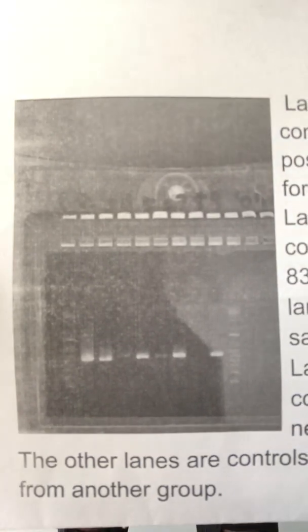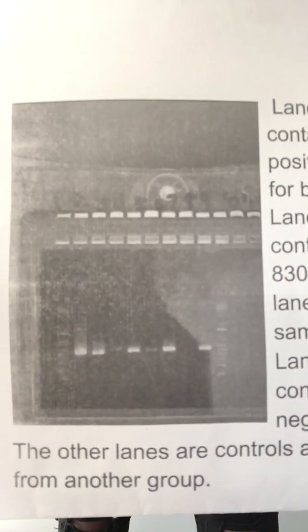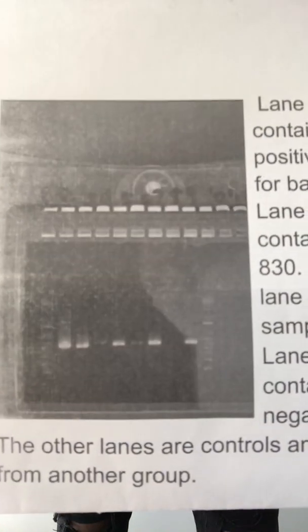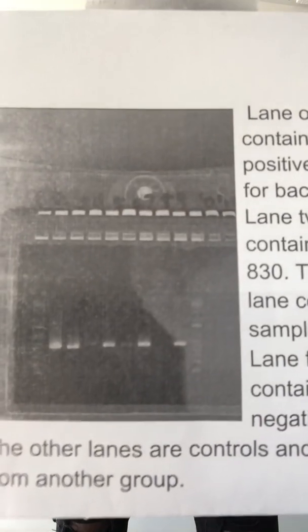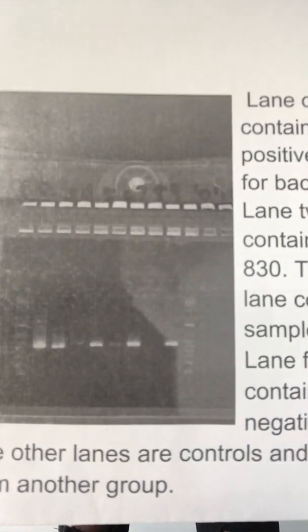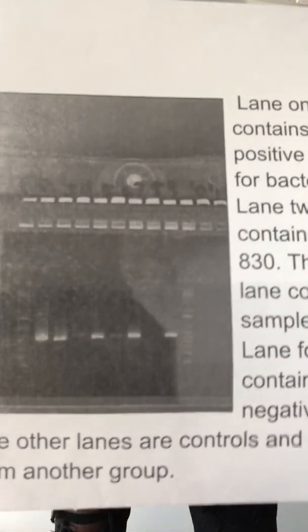Unfortunately, our samples were accidentally thrown out, and we had to use a random DNA sample. We had to change the sample from 830 to 840 because there was no data for 830, and we thought 840 was the most similar to 830. We also used 620 from a previous class, which was used in the DNA analysis.